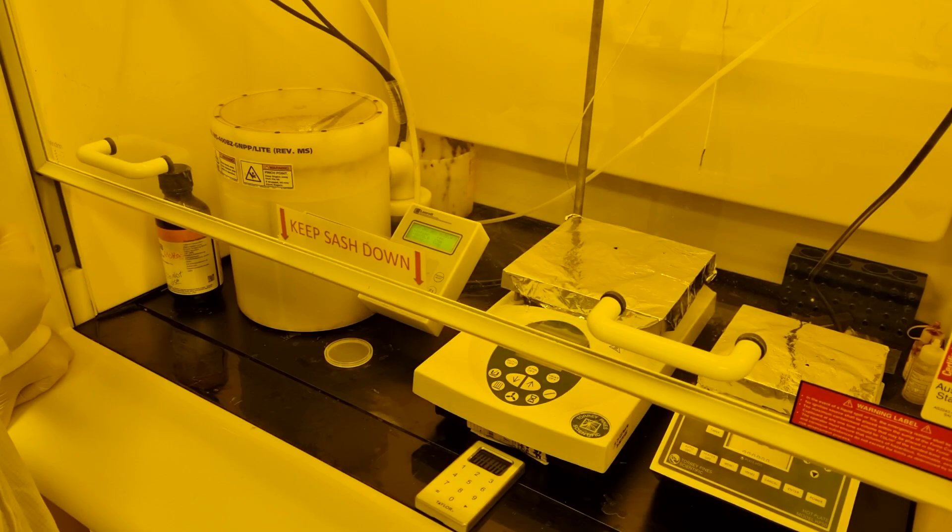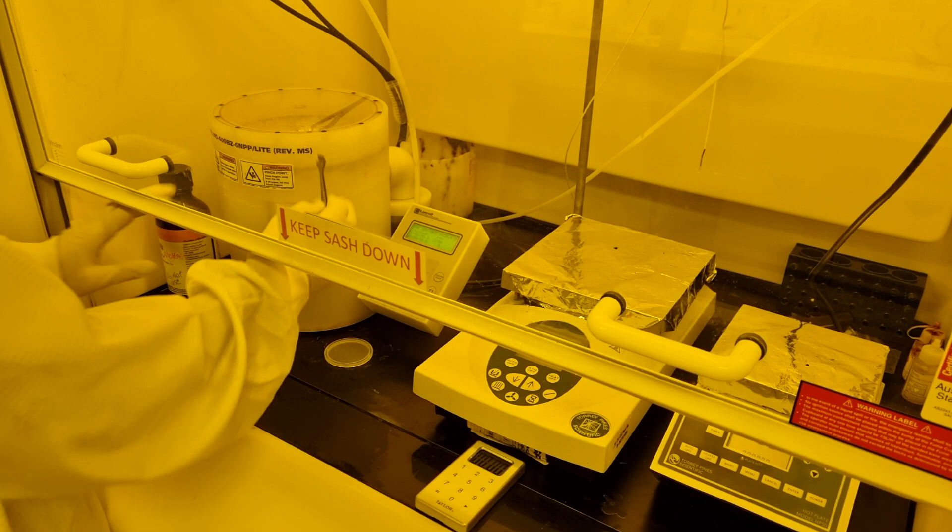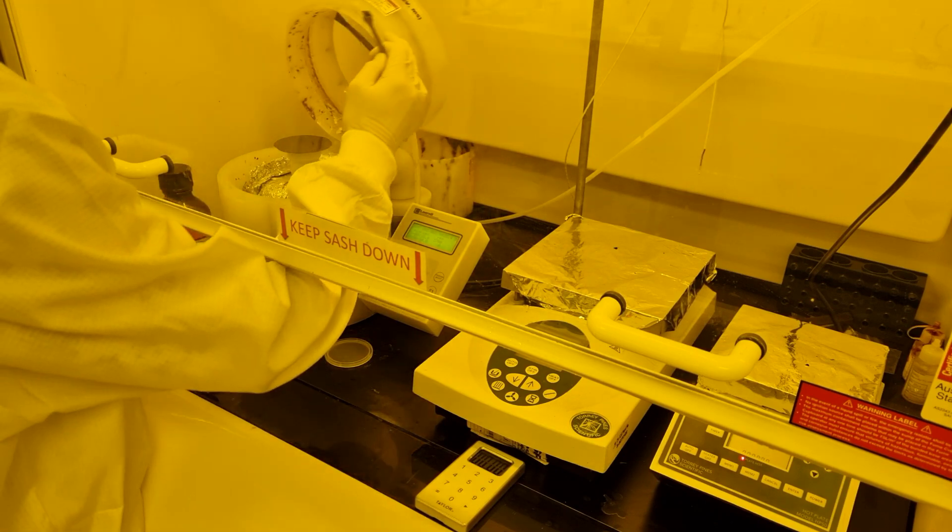So 20-25 is about 25 microns thick, while 2100 is 100 microns thick. Spinning faster will make the film thinner and spinning slower will result in a thicker film.